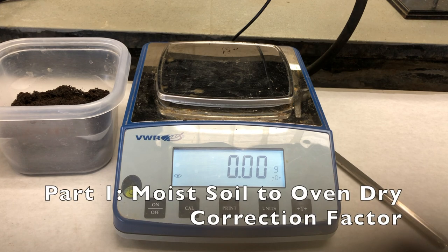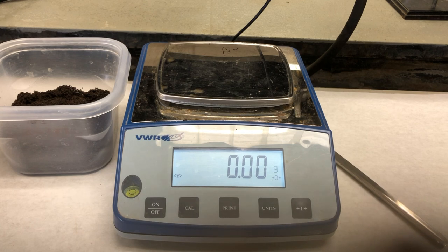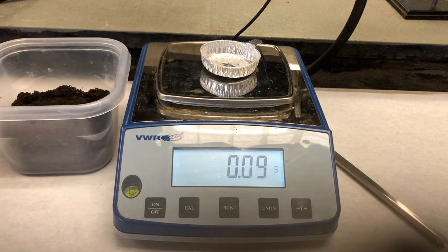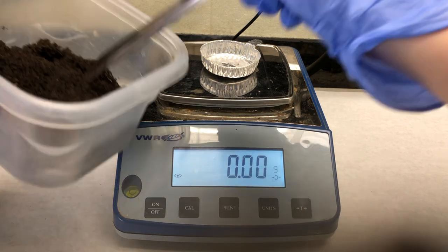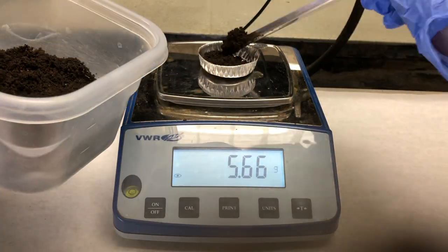Since fresh soil is used in this procedure rather than air dried soil, it is necessary to complete a moist soil to oven dry correction factor. To begin, weigh the empty tin and record. Then tare the scale and weigh approximately 10 grams of fresh soil into the tin and record the exact weight of soil added.